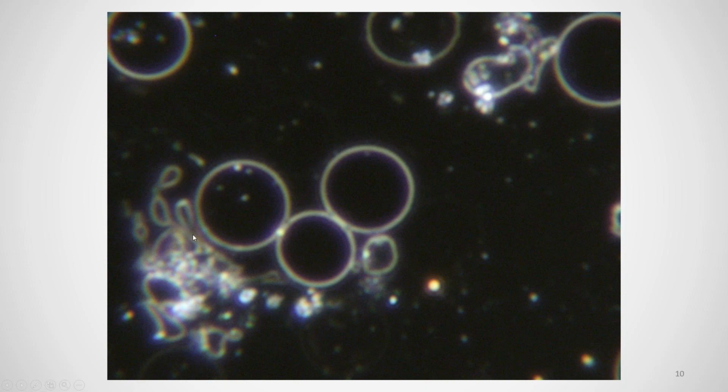So these are red blood cells, and then these are pleomorphic patterns. These are pleomorphic bacteria basically forming around the thrombocytes here. So a very, very high level of magnification here, and certainly something that won't be possible with a basic non-suitable dark field system.